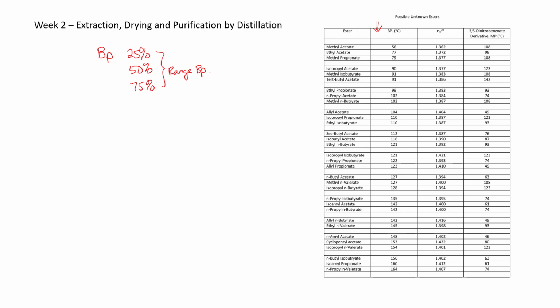And you have to remember all the way back to experiment 1 and 2 when we did that to determine the boiling point range for the liquid. So when you see ranges in the physical data that I'm going to show you, those ranges came from students measuring when 25% had distilled, 50% distilled, and when 75% had distilled.